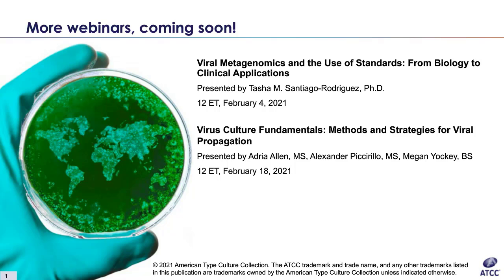It's not necessarily going to be detrimental to cells if they are submerged in liquid nitrogen. The biggest concern there would be any sort of cracks or openings in the vial where liquid nitrogen would be able to seep into it.